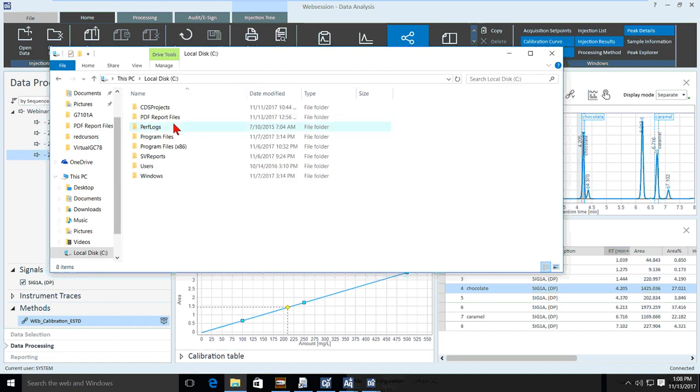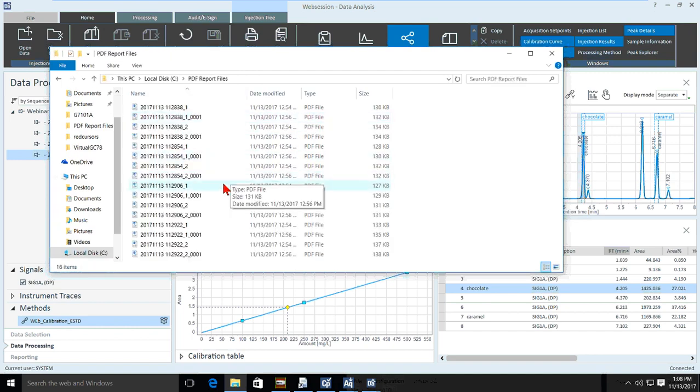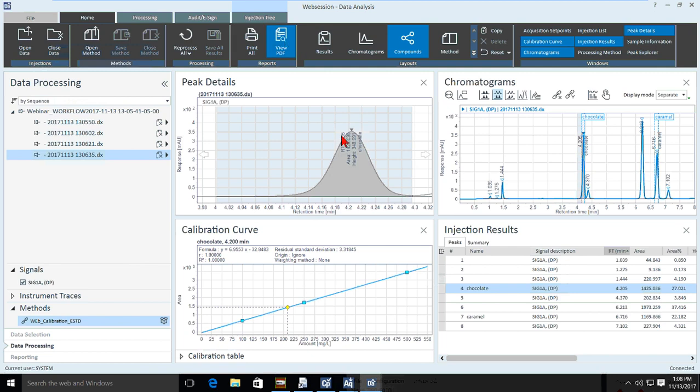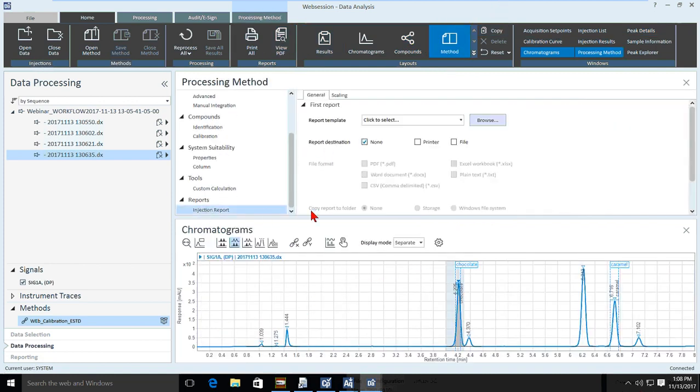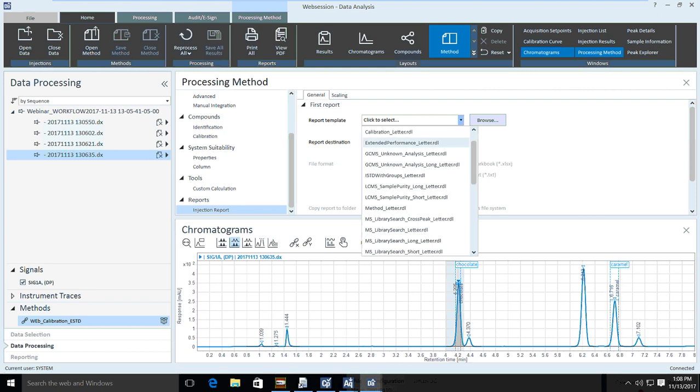If we go through and see again, all right. Well, yeah. Injection reports not generated, no defined. Oh, okay. This is what happens when you dive through 2 different methods at one time as well, right? So I went back and actually assigned the templates to the other method.